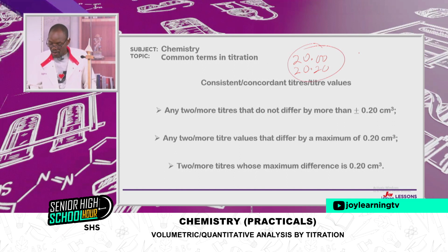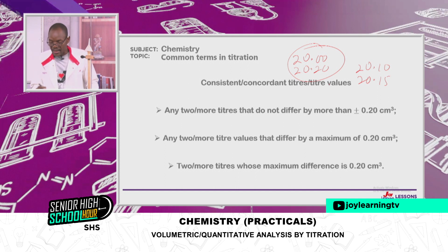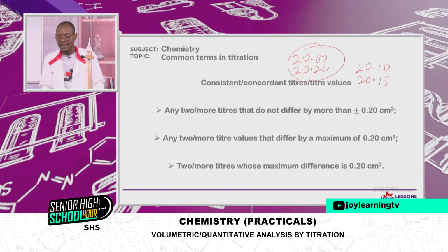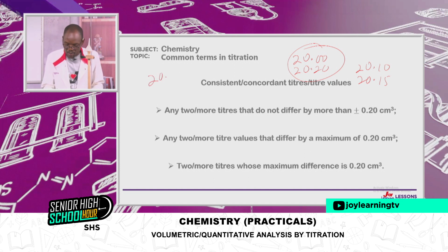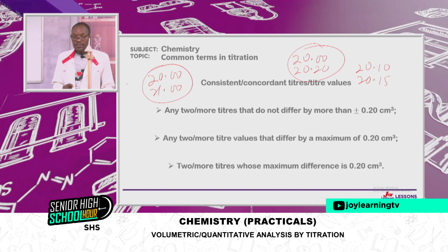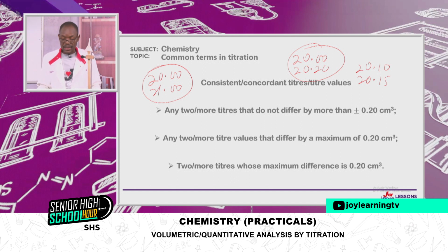If I have 20.10, 20.15, these are all consistent values or concordant values. However, if I have, say, 20.00, then 21.00, these 2 values are not consistent. Therefore, we can't use it in calculations.